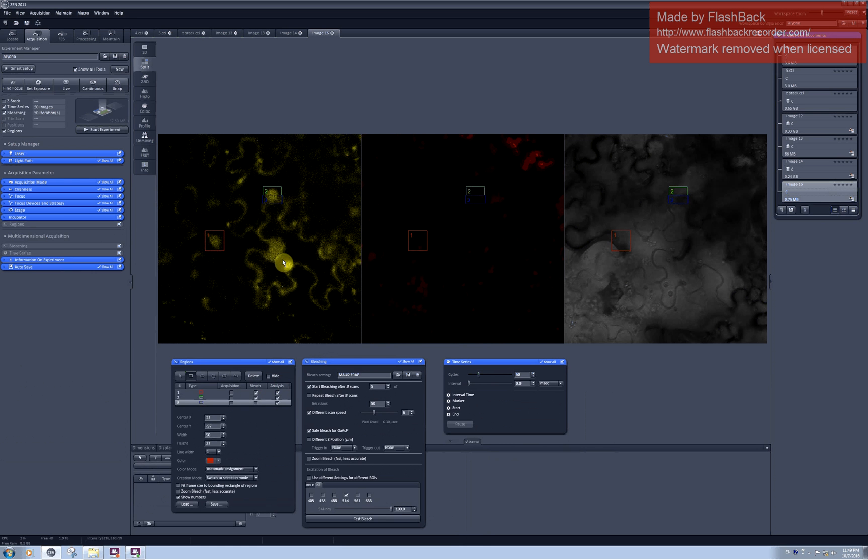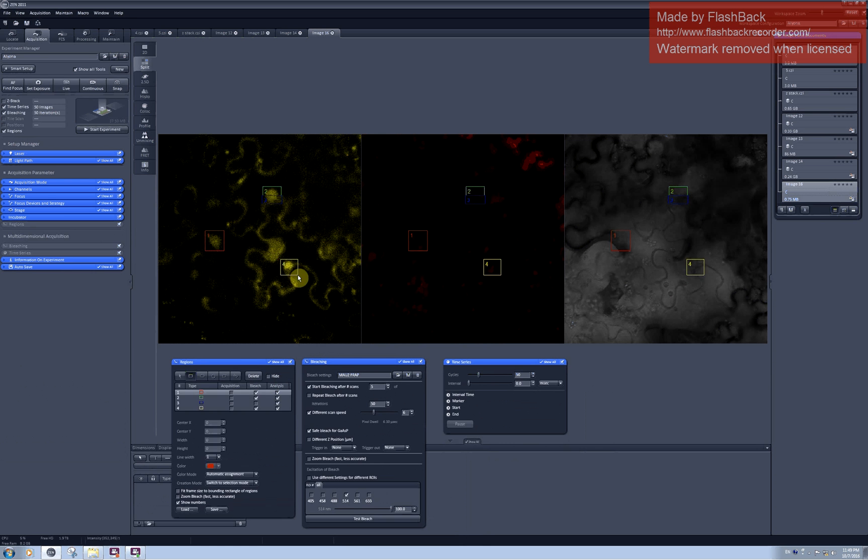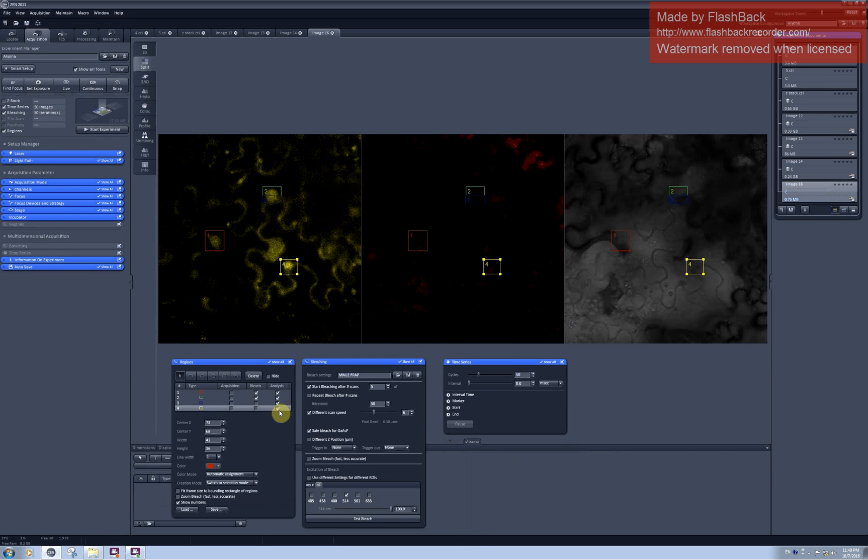For the third nucleus I would like to perform no photobleaching and just analyze it. This will be my control for photobleaching caused by scanning per se.